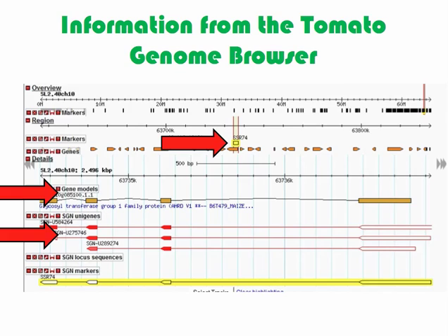When using the tomato genome browser, it is often helpful to work from the top down. The first thing to note is that SSR74 falls within a gene. Knowing that SSR74 falls within a gene, a next logical question is: what is the function of that gene? The gene model's information is a prediction of genes based on analysis of the DNA sequence and its similarity to the sequence of known genes and gene families. Based on gene models, SSR74 is predicted to be a part of a glycosyl transferase gene. Looking further down the browser, the SGN unigenes are gene sequences determined from multiple expressed sequence tag, or EST, reads.